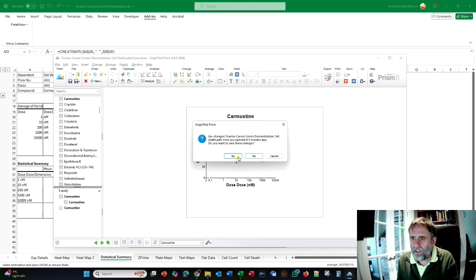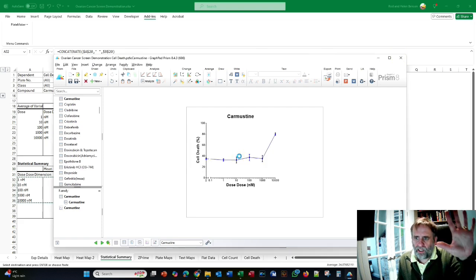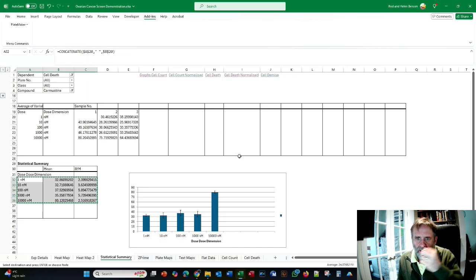So I could do it manually if I wanted to, but what I'm actually going to do this time is regenerate all the graphs using the Prism Graph Maker that we used before. So the way I'm going to do this is we've just refreshed the table, so all three changes of the three drugs have been made, and we're now going to run the program again as we did before, but this time I'm going to use the other template, and I'm going to be following the instructions as per the tutorial 1 that we've spoken about.